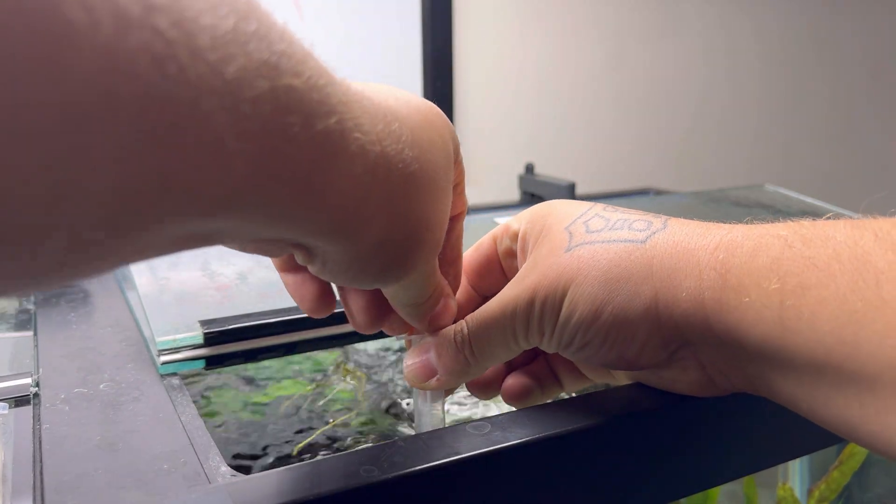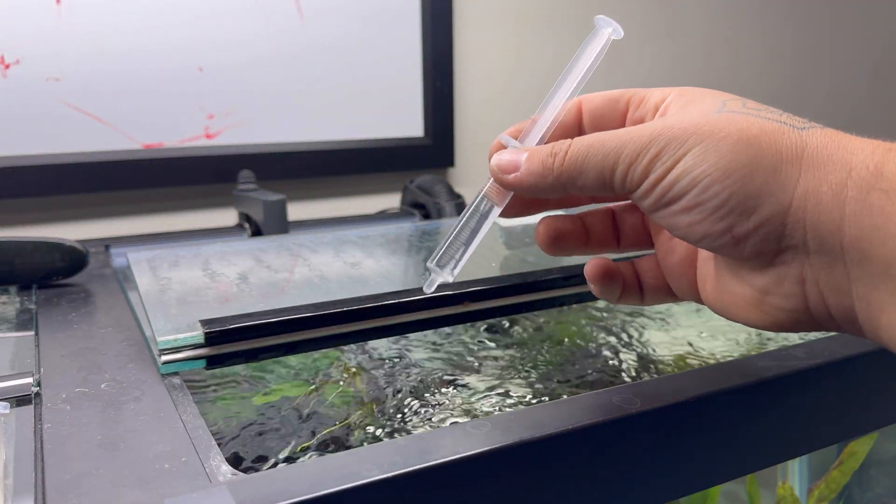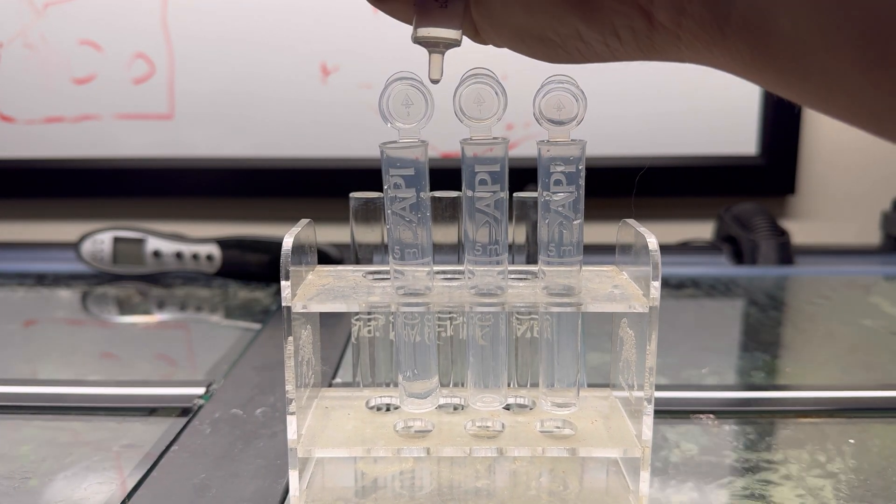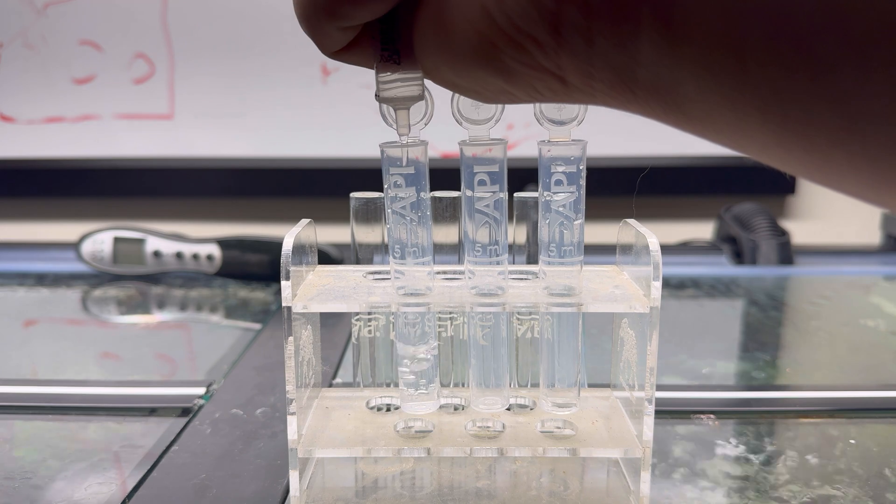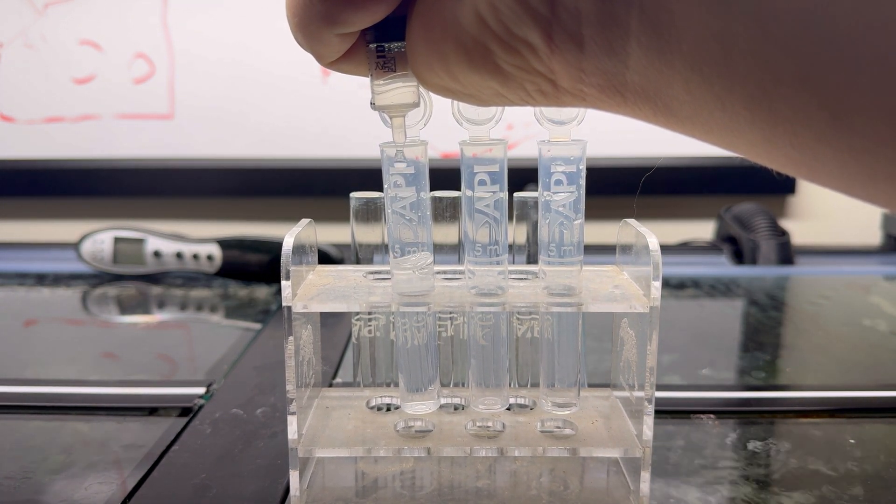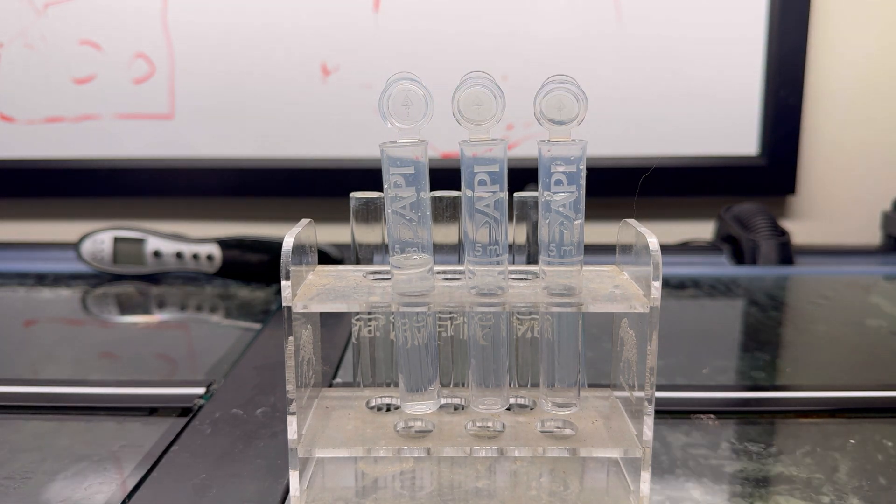This is a six-milliliter syringe which gives me a little bit more than I need to fill up one vial. Coming back to the vial, I'm going to fill up this one here to the five-milliliter mark. As you can see, drip by drip gets me to that perfect level every time.